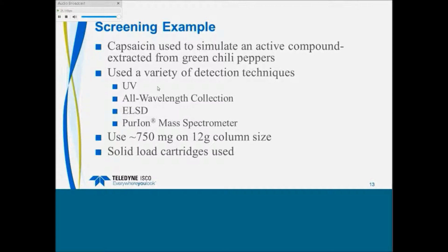The reason for this is the extract has, as we all know, a wide mixture of compounds. I used a solvent, or a mixture of solvents, to dissolve this mixture of compounds, but this solvent mixture is also very strong chromatographically speaking, so if I just did a liquid injection, the compounds would not stay on the column, they would just run right through the column without any interaction at all. So the solid load cartridges improved the chromatography greatly.